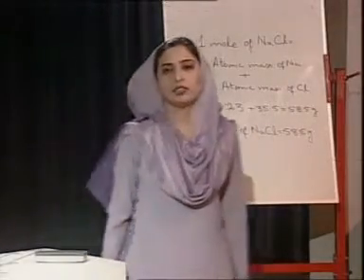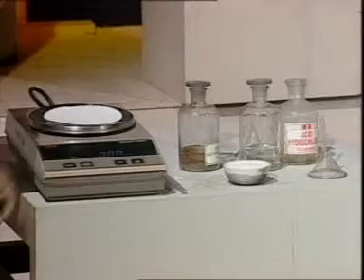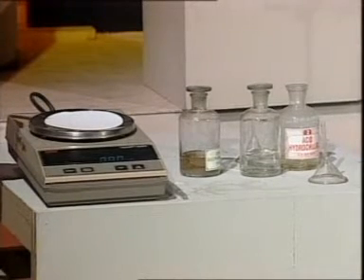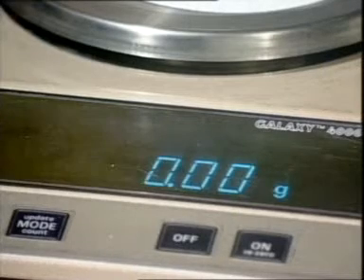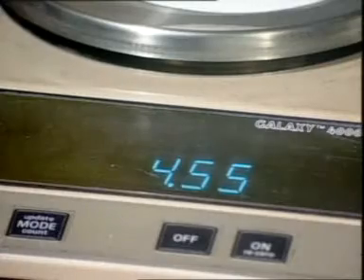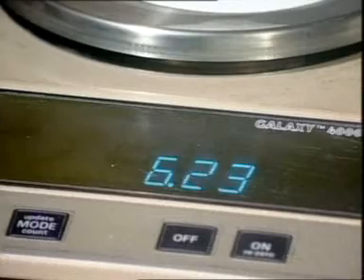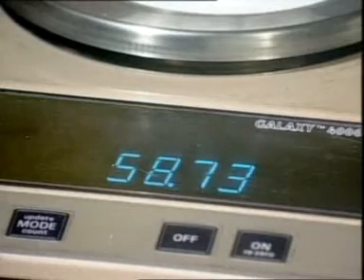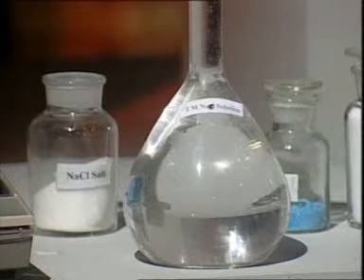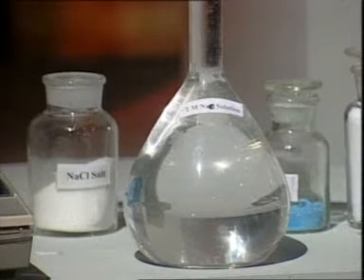Let's weigh 58.5 grams of sodium chloride. Here I have salt, that is sodium chloride. Now I weigh 58.5 grams of sodium chloride. Here we have 58.5 grams sodium chloride. We will mix this sodium chloride in 1 liter of water to make 1 molar solution of sodium chloride.